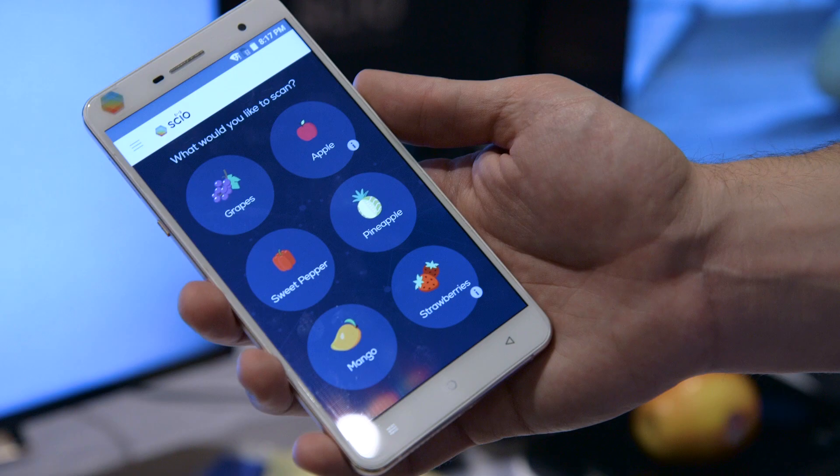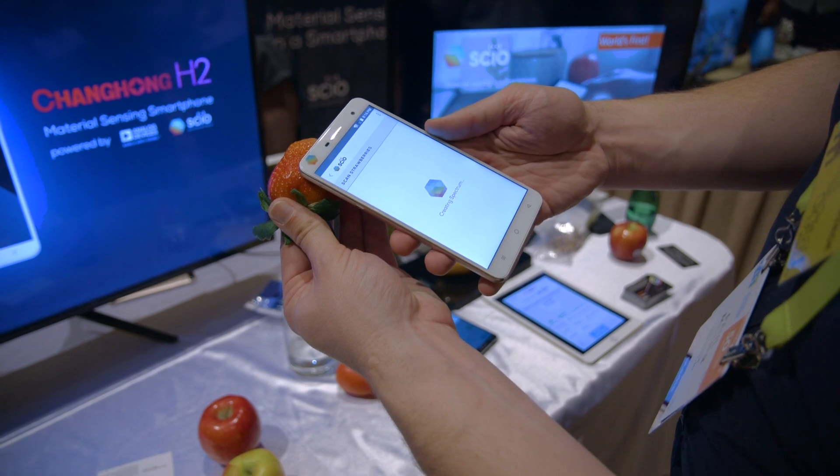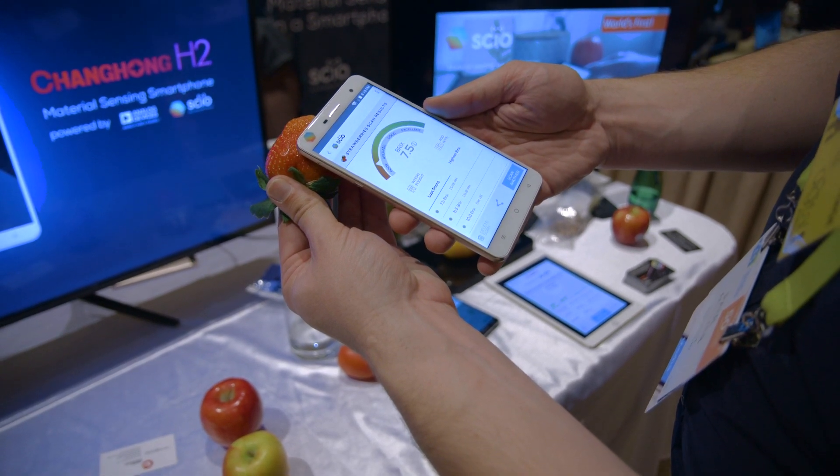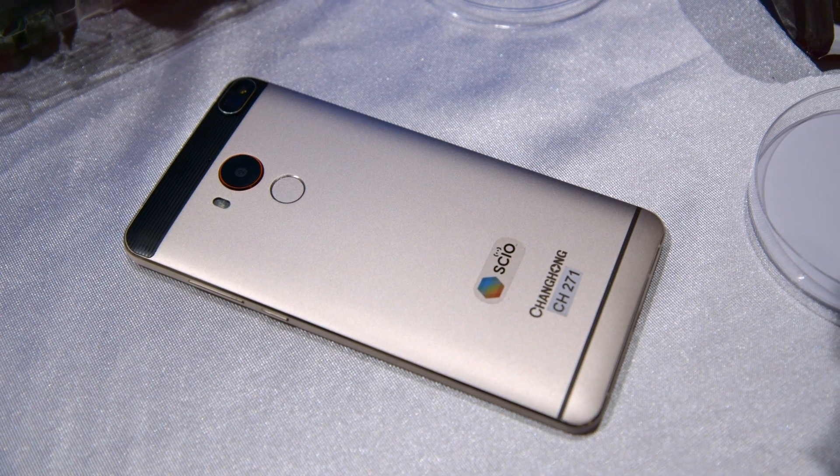So you can check your Viagra to see if it's fake, you can check your drink to see if there's alcohol in it, you can check your strawberries to see which one's sweeter. It's kind of crazy, and it's literally inside of a mobile phone. There are a lot of ways to use this SCiO sensor.